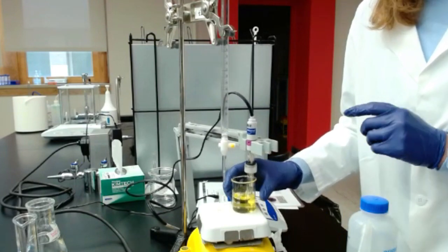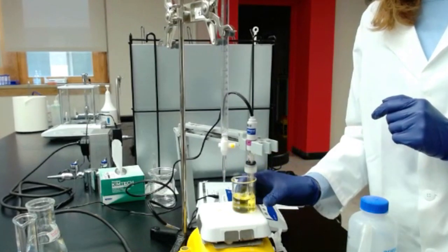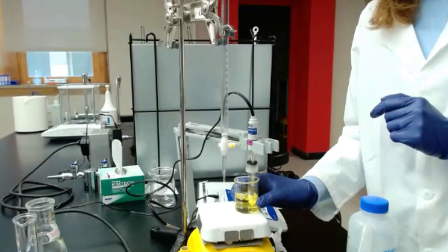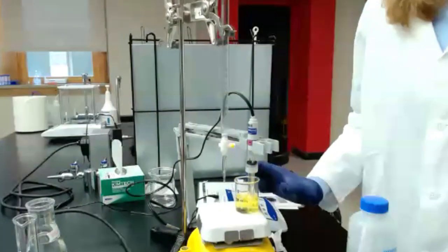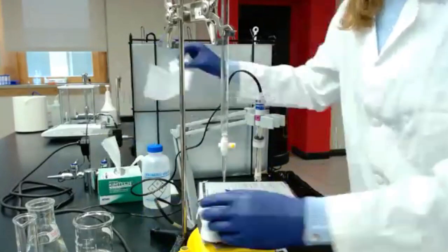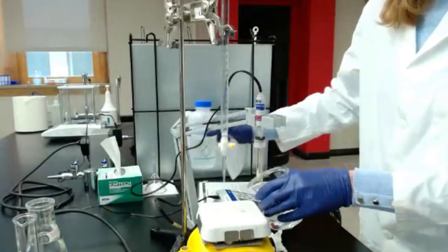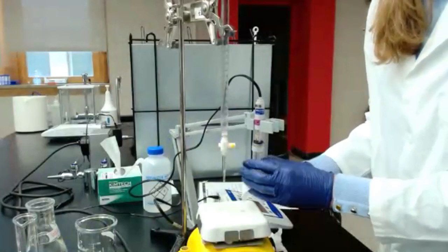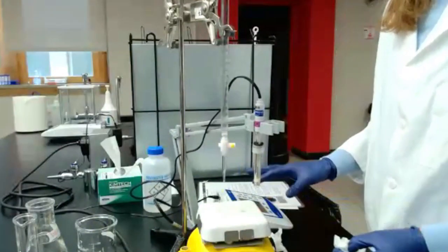All right, and it is stable for me, so I do the calibration. So for those of you who did the calibration, make sure once again, once it's done, you accept the calibration. And so you should have a value in between 95% and 100%.